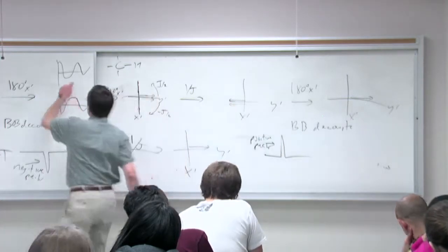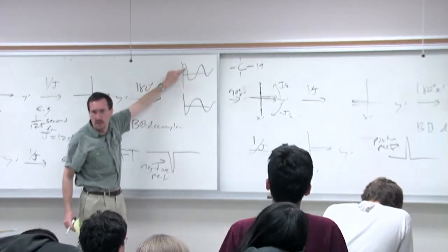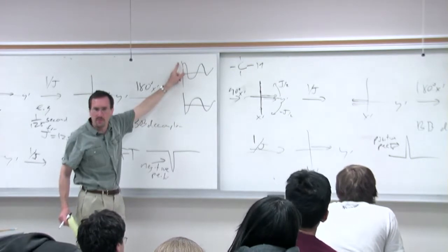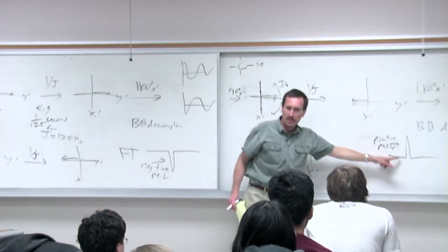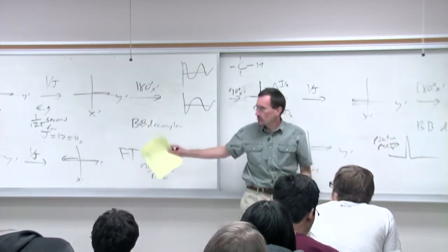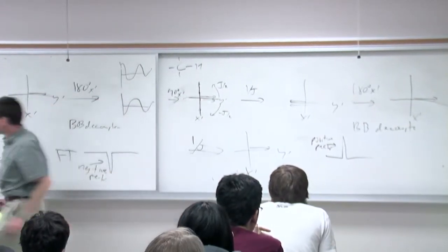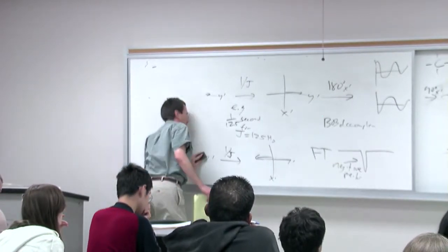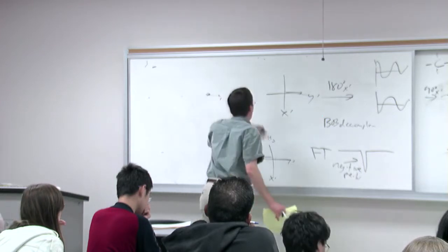Right, this translates into this situation here where you have a positive cosine wave instead of a negative cosine wave. And the Fourier transform of a positive cosine wave is a positive peak. So you can see how we've differentiated our methynes from our quats by way of the spin echo experiment.